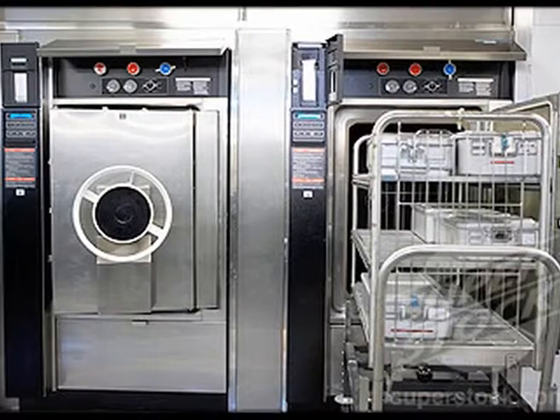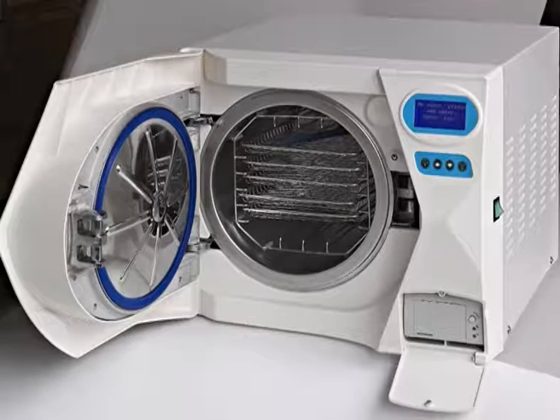To overcome this, we have developed another type of autoclaving that we call the pre-vacuum autoclave. Therein a separate instrument is used to take out the cold air which was present inside the autoclave. Then the pressure that is applied is pretty high as compared to 15 pounds per square inch.